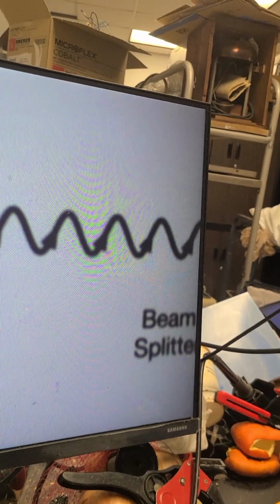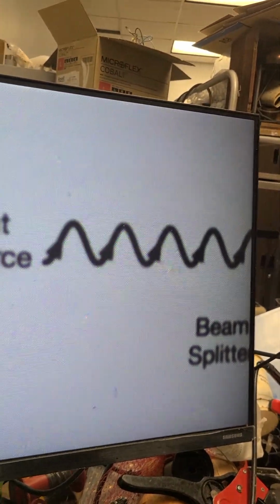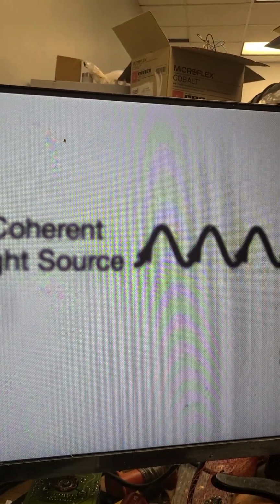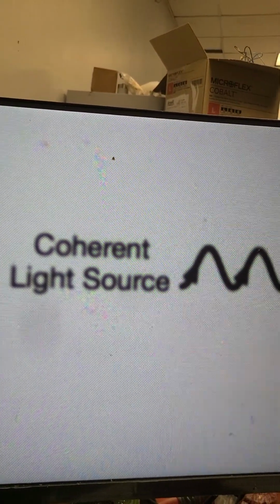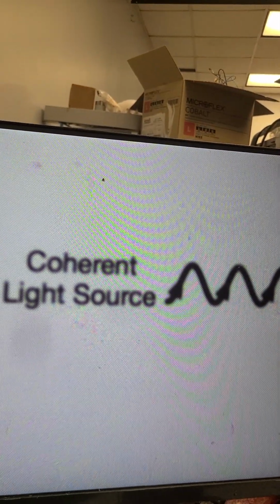So 8,000 divided by 10 is 800, divided by 2 is 400. So about 400 dots per inch is the range we're dealing with for the shorter end of the infrared spectrum. Happens to match with our state-of-the-art of optics.